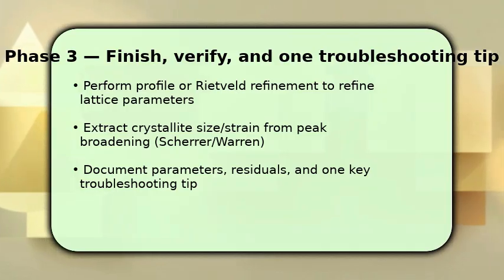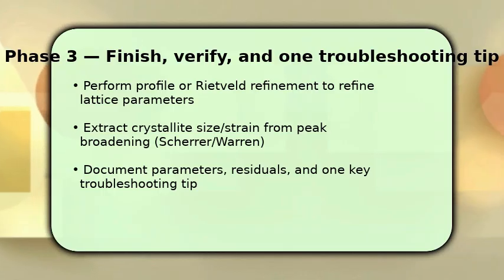If fits fail, check background modeling and peak overlaps first. Fixing those usually resolves most issues and lets you rerun a stable refinement for a final report.